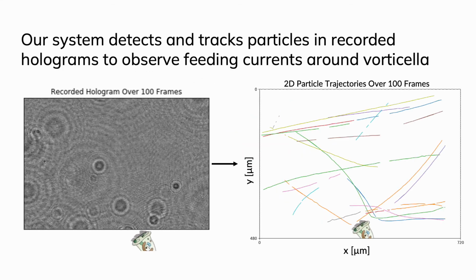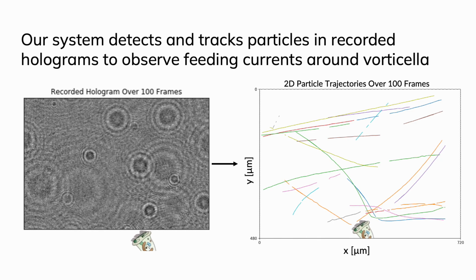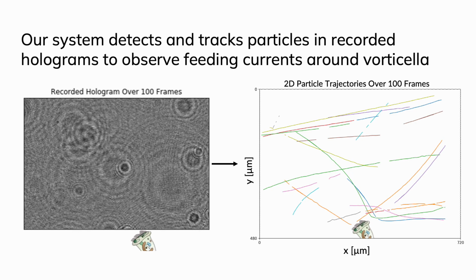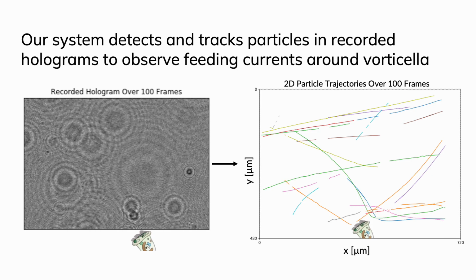We presented a system that can successfully track particles around a Vorticella, providing a first step in understanding this organism's behavior. We input real noisy data as shown on the left, and extracted feeding currents in 2D and 3D.